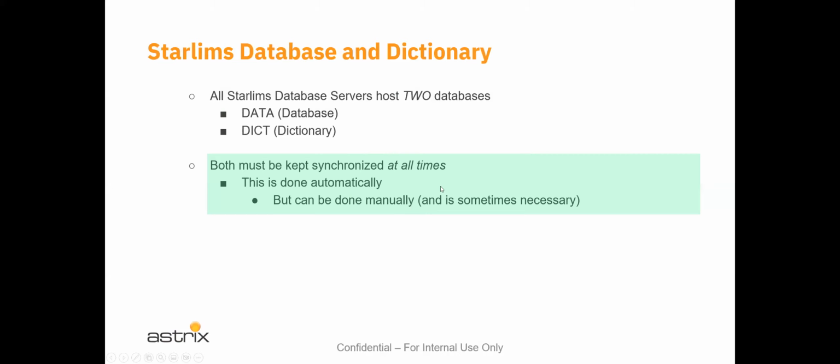However, at times when you make changes, you've got to push that update to the database, and there's a function in the designer that allows you to do that. You'll be trained on how to do that.